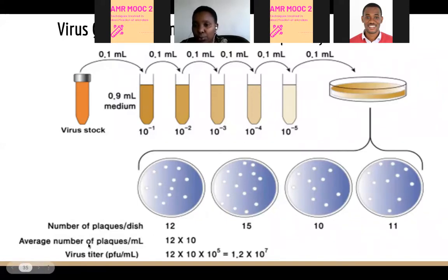So you have to take your vaccine dilution and quantify the number of particles in order to get the required dose of the virus particles. So plaque assay is one method, but we have another one, which is TCID 50. This is also, you take the inoculum and you dilute it and get the different number of dilutions. And from there, you can plot in a graph and get a number of viruses that you are expecting from the virus.